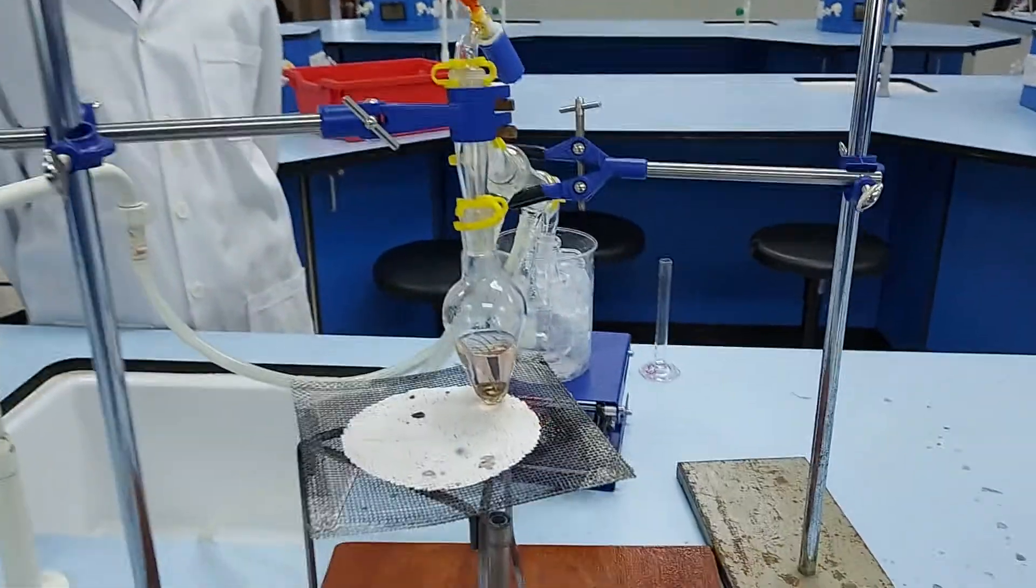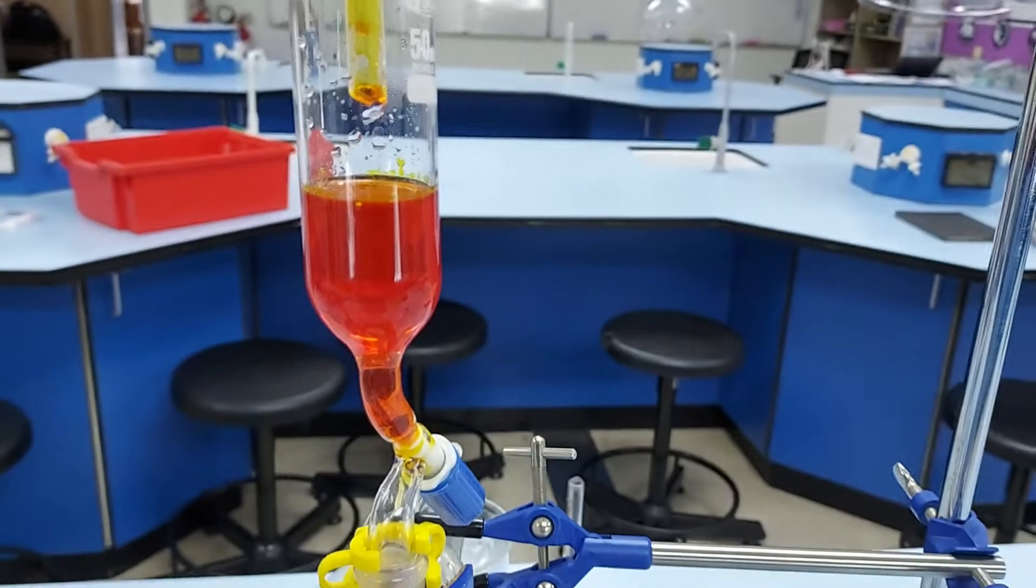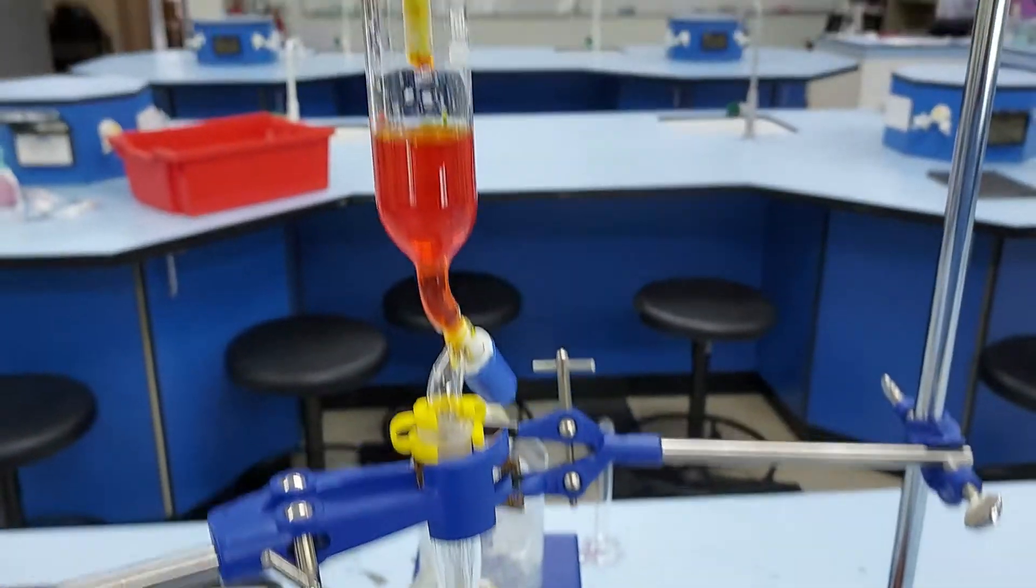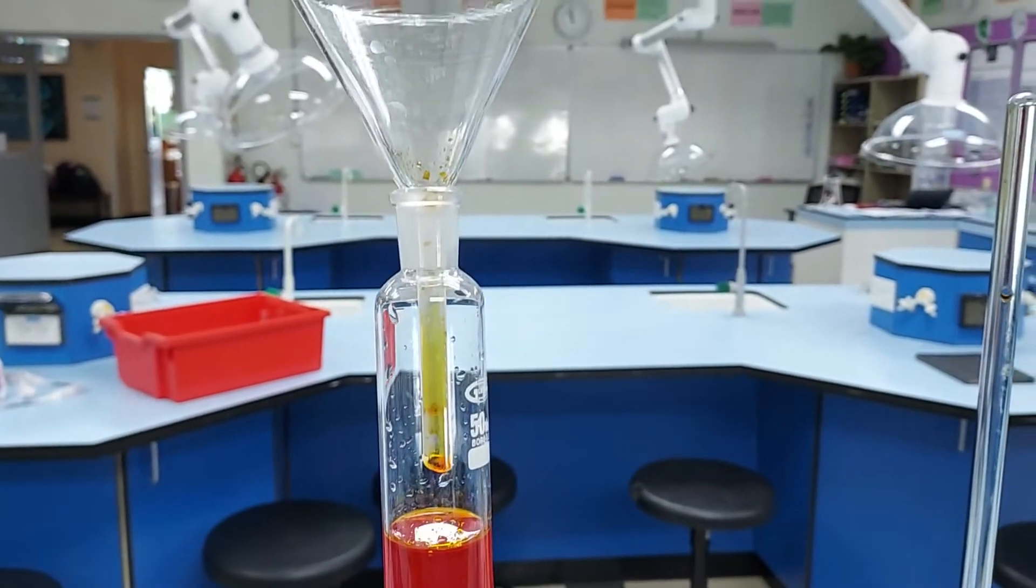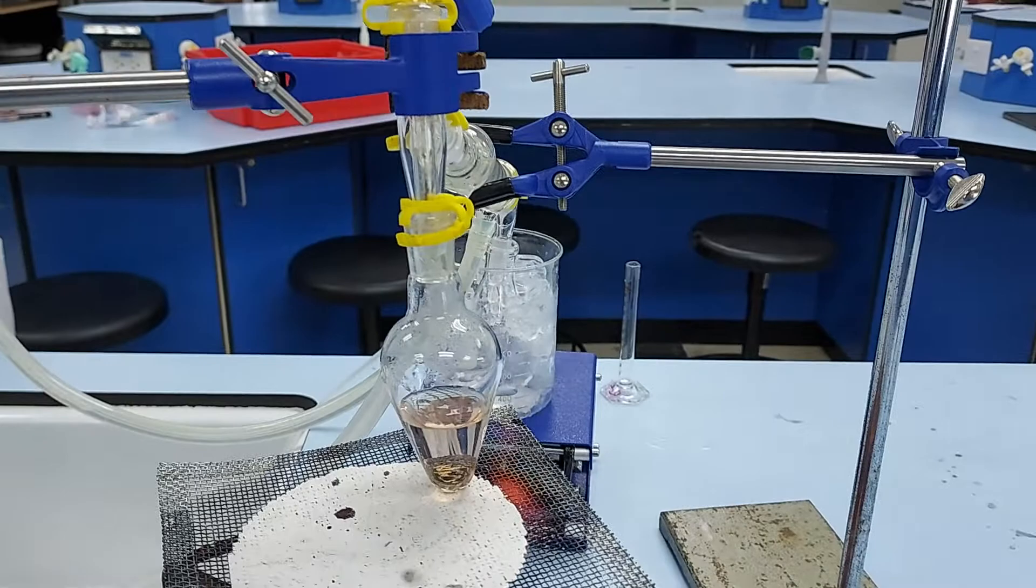In this experiment we're going to oxidise ethanol to ethanal using sodium dichromate. You can see here we've got a funnel going down into a pear-shaped flask.